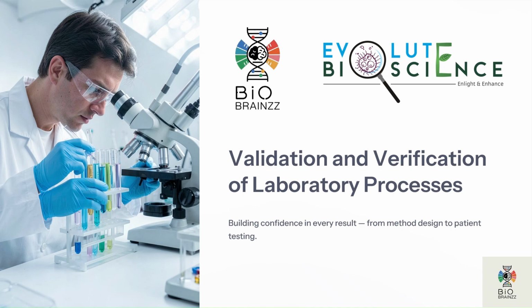Whether we are performing analytical testing, clinical diagnostics, microbiological analysis, or pharmaceutical quality control, validation and verification ensures that our methods and systems consistently perform as expected. In this session, we will understand the concepts of validation and verification, their differences, performance studies, regulatory expectations, and their importance in maintaining laboratory credibility.